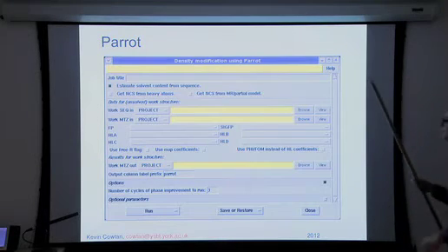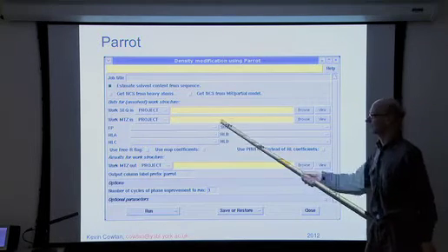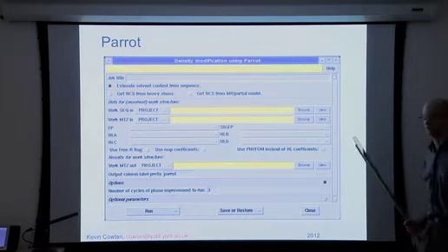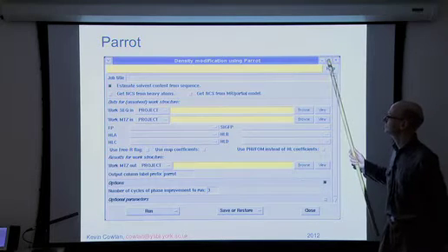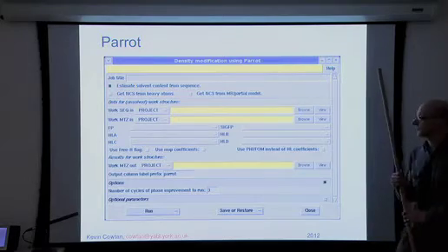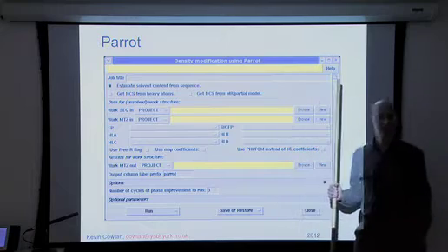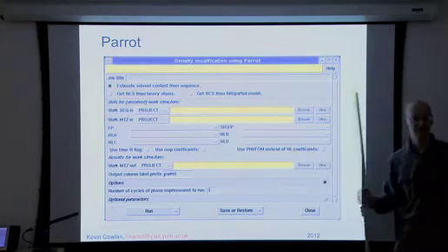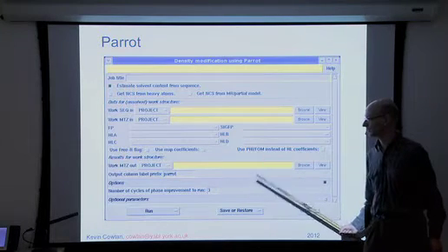Here's what it looks like. So normally you just give it your sequence and your MTZ. It picks up the columns. You have to tell it your Hendrickson-Lattman coefficients. You can click this if you've got phase and figure of merit instead. And then you just click run and it works. If you've got non-crystallographic symmetry, then you can click this to tell it your heavy atoms, or click this to tell it a molecular replacement model or a partial model if you've done some initial model building, and it gets the NCS from those.